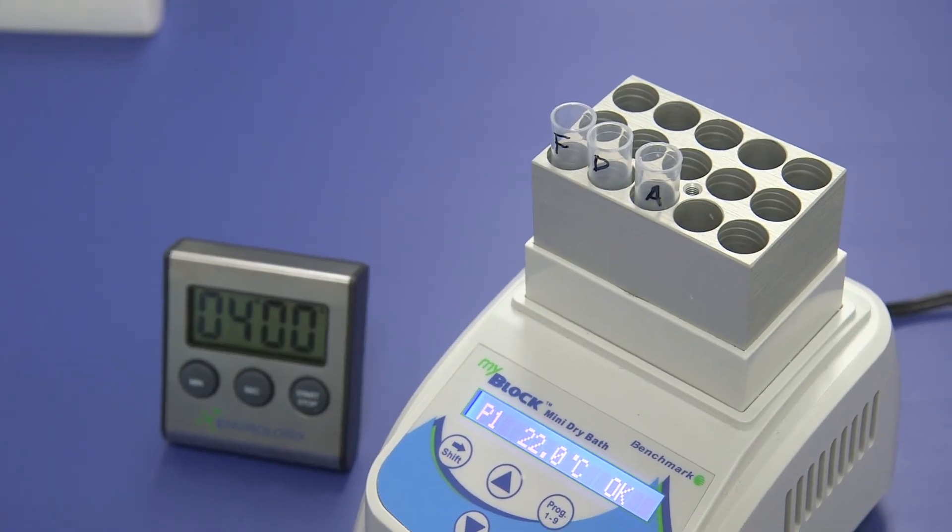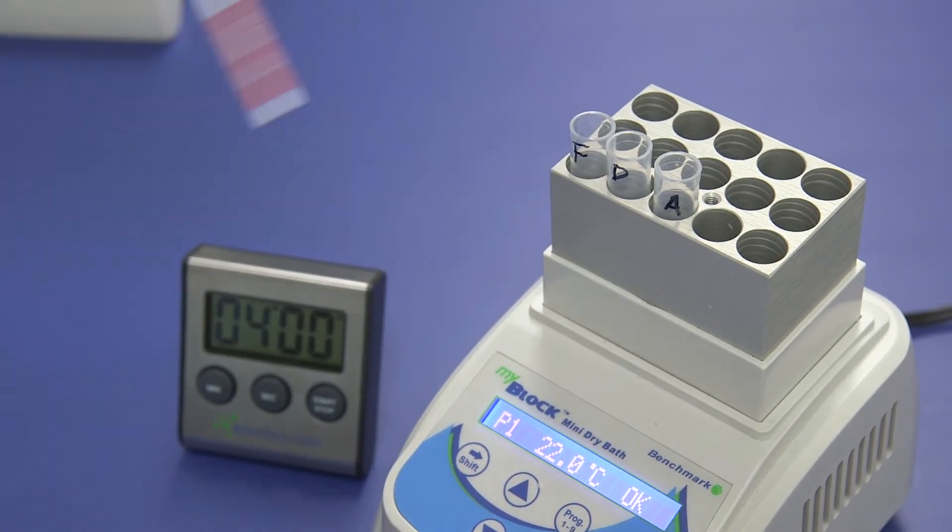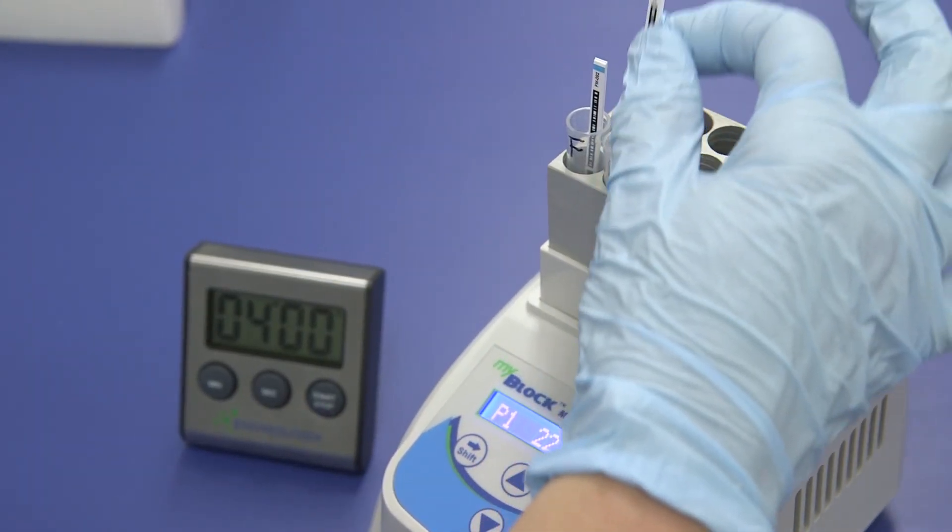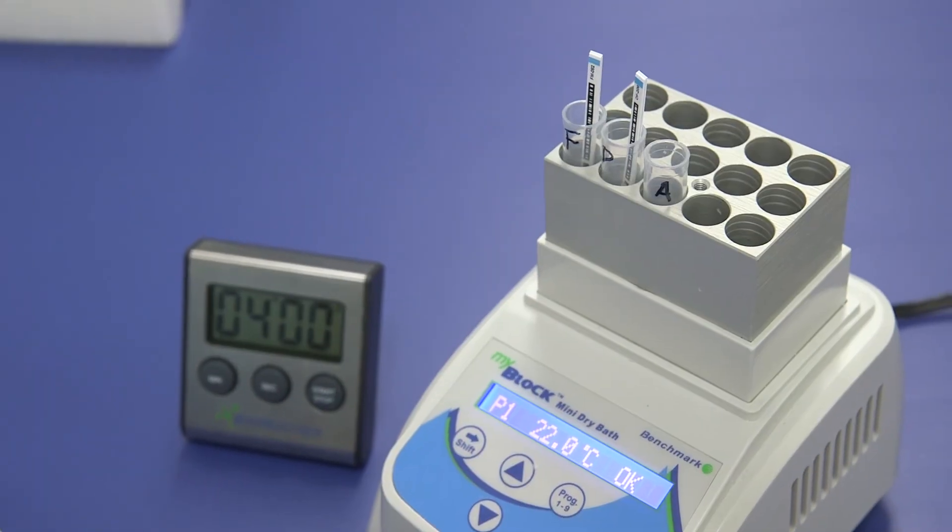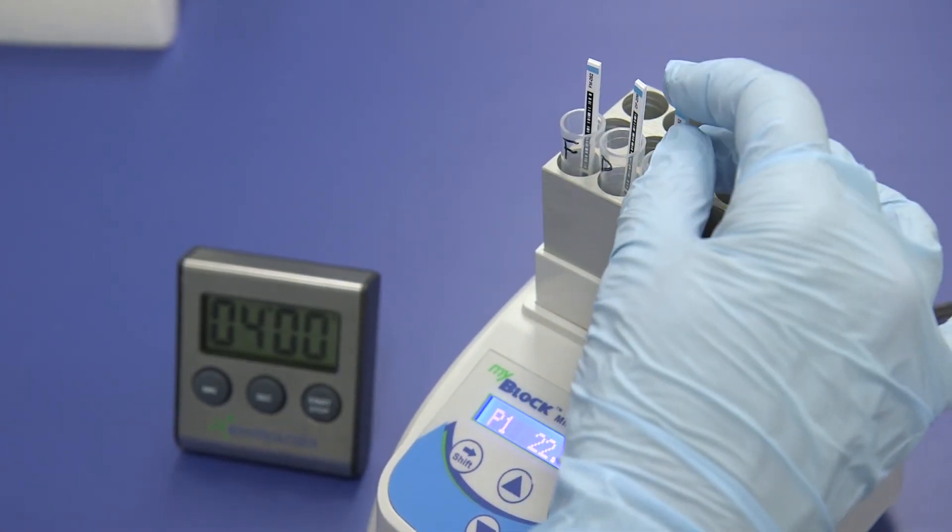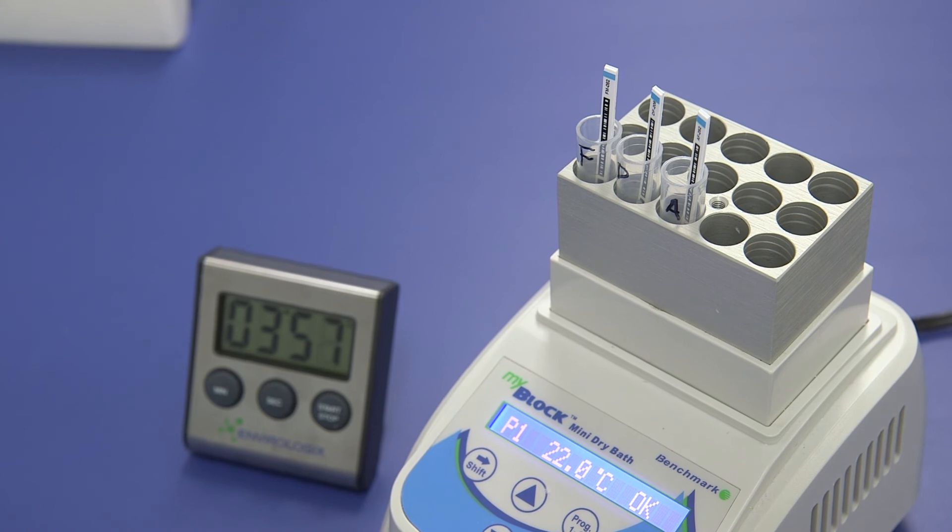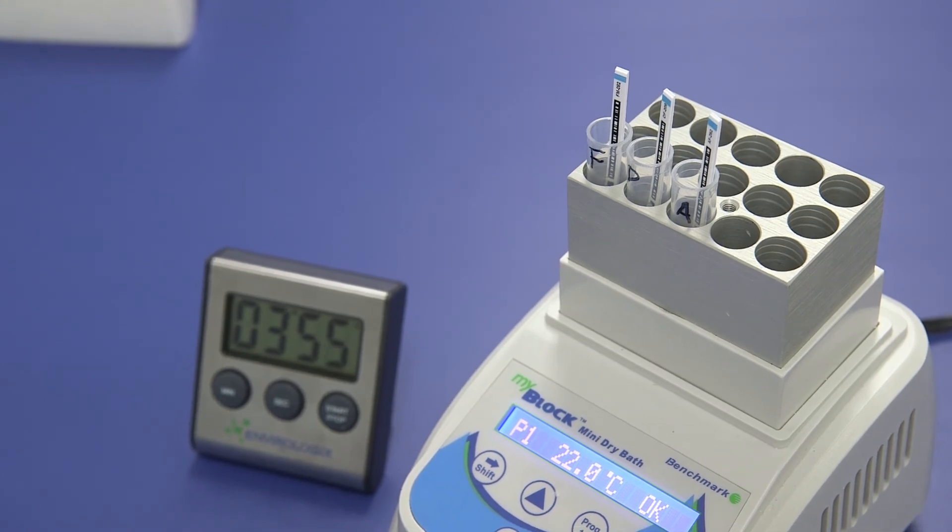In quick succession, add a Fumonisin Flex test strip to the F tube, add a DON Flex test strip to the D tube, and add an Aflatoxin Flex test strip to the A tube, arrows pointing down. Allow the strips to react for exactly four minutes.